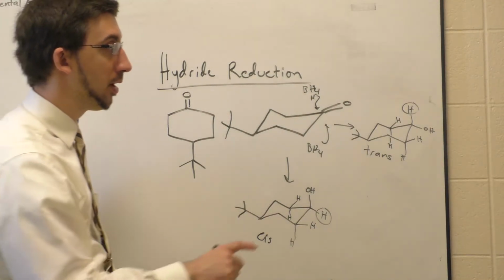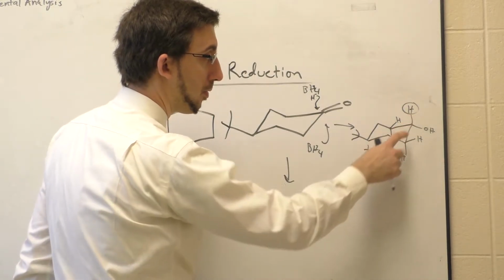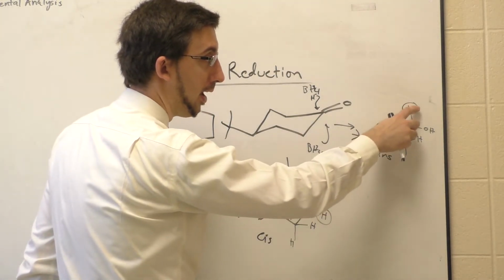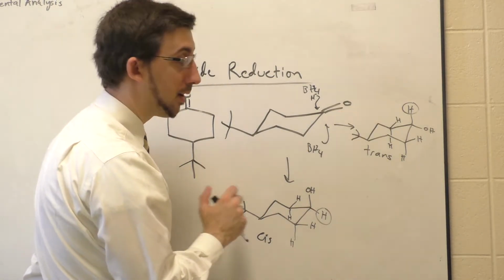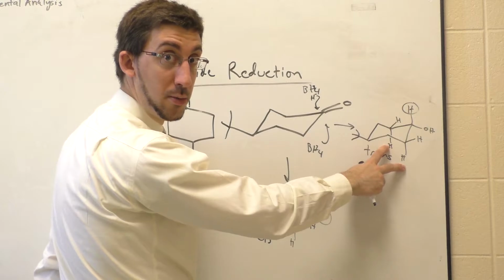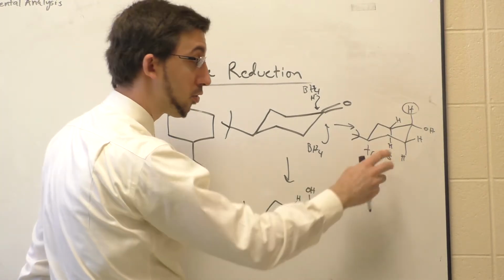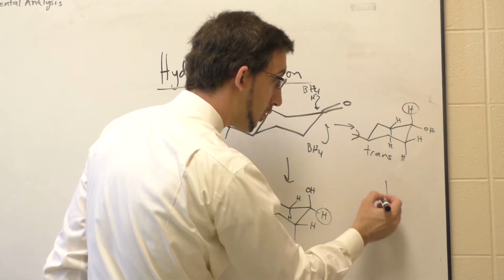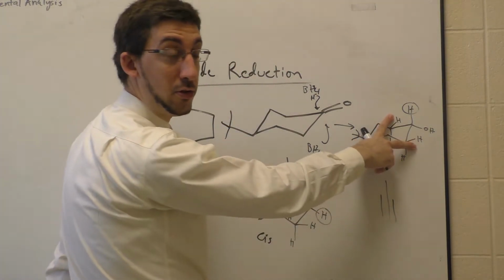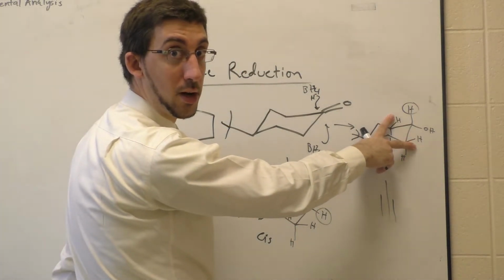And so for this one on the right, the trans, what I'm going to get is these two hydrogens here will split that hydrogen with a large coupling constant. And so essentially I'm going to treat that as, okay, I've got 2 neighbors with a large coupling constant. That's going to be a triplet. And then I've got 2 other neighbors that also split that hydrogen, but with a much weaker coupling constant.